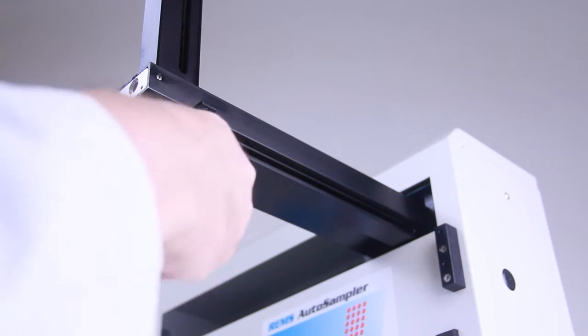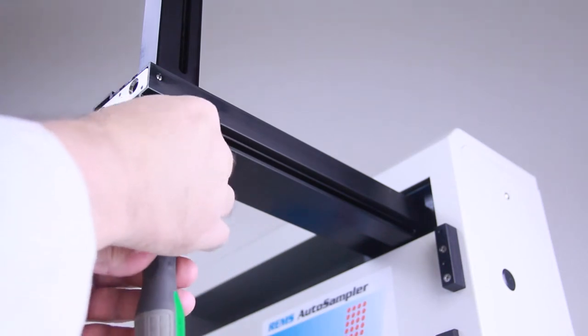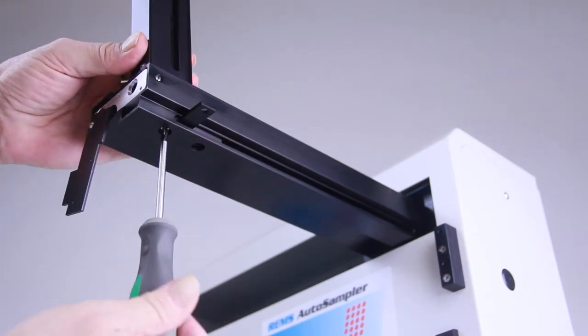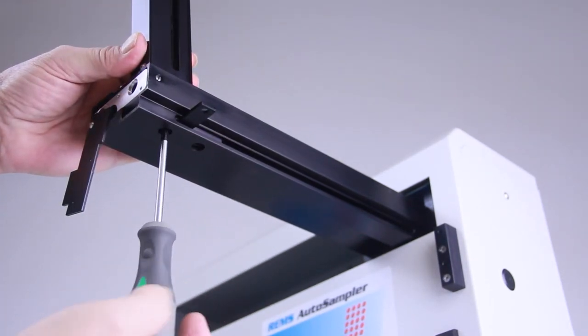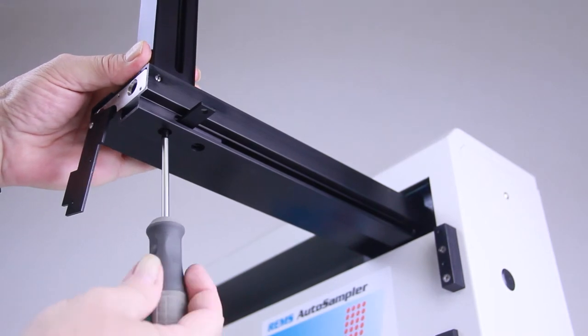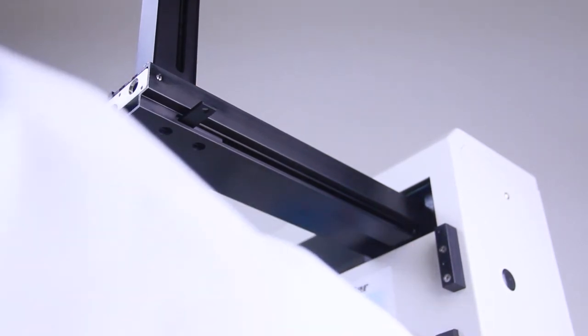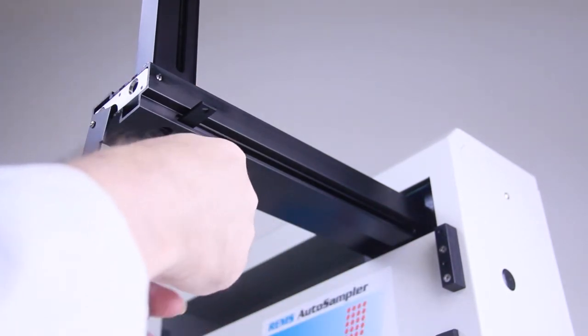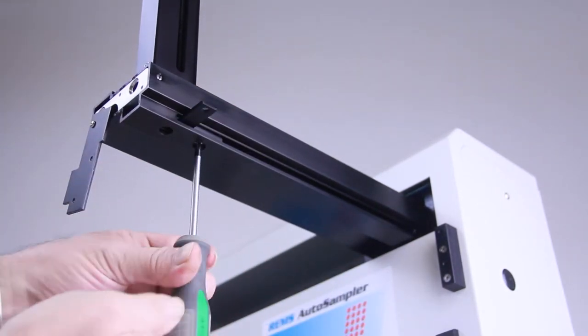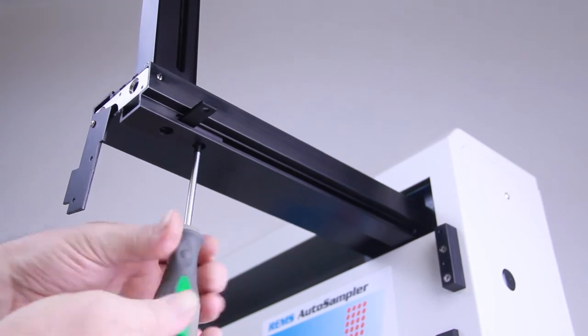With the supplied screws, secure the vertical arm to the horizontal slider. It may be necessary to move the slider back and forth slightly to align the mounting holes with the openings on the horizontal arm.